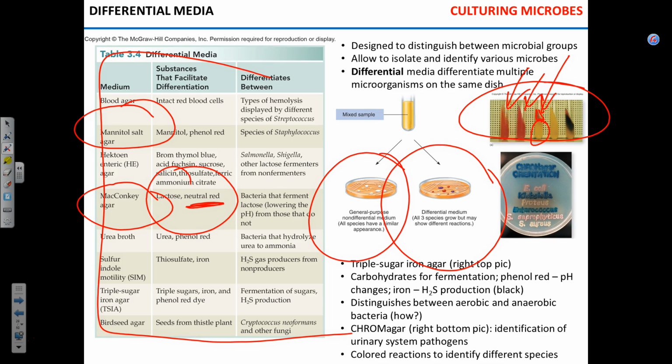So this is an anaerobe, right? This one apparently ferments the sugar, but it's not afraid of air. So it's probably an air-tolerant anaerobe, the one that can survive in the presence of oxygen, or a facultative anaerobe.